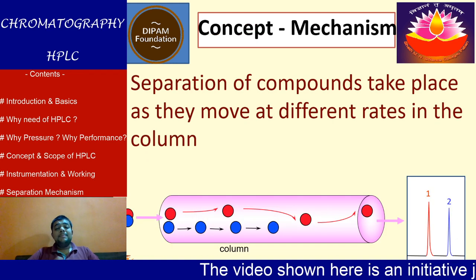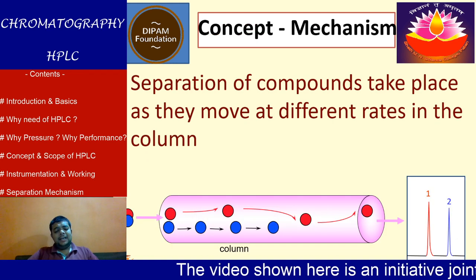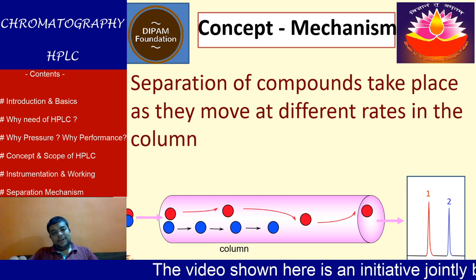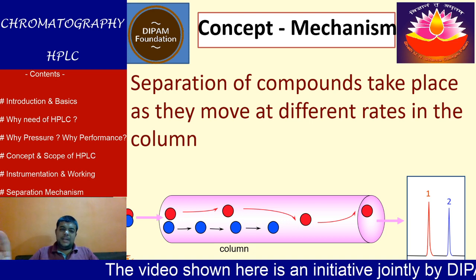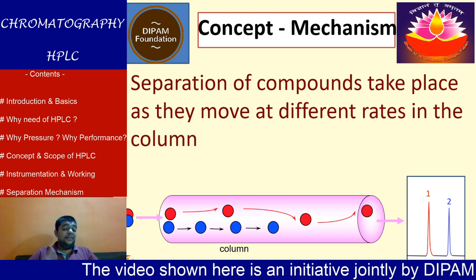So what is the concept and mechanism behind this technique that we are learning as of now? If you look at it, separation of compounds takes place as they move at different rates in the column.